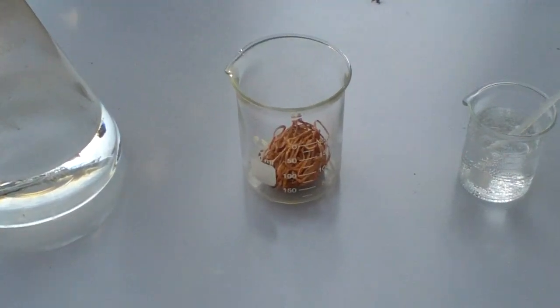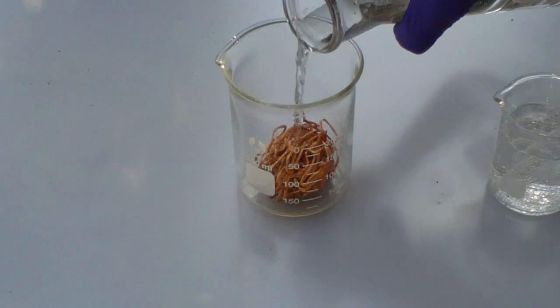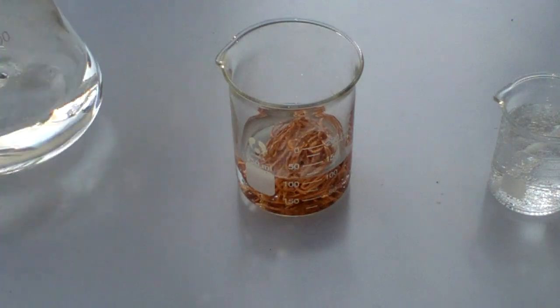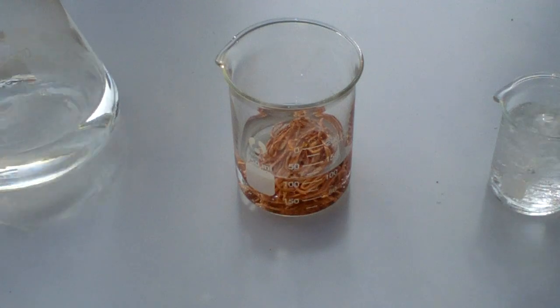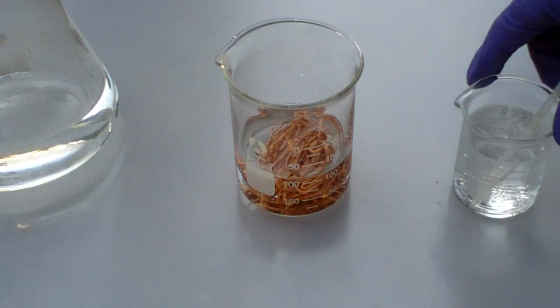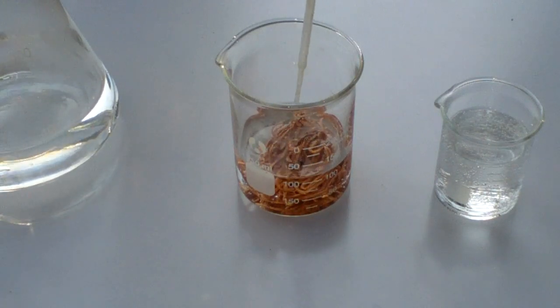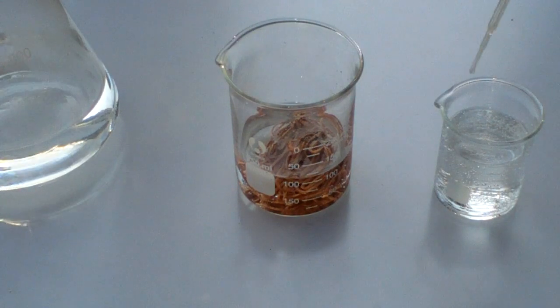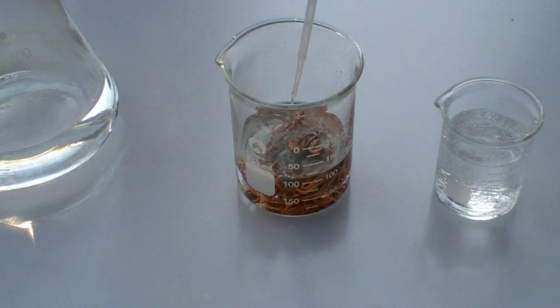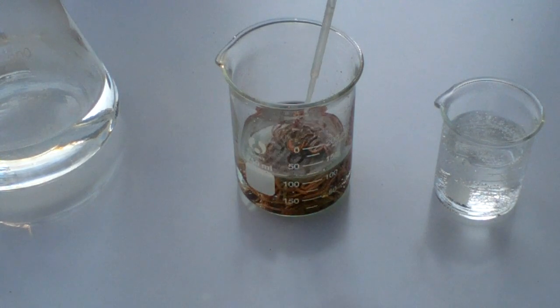So the first step is to pour some hydrochloric acid over your copper metal. There should not be a reaction. Then take some of your hydrogen peroxide and squirt it in. You should see the solution start to go green and bubble. Add the peroxide slowly, as the reaction will be vigorous once it starts.